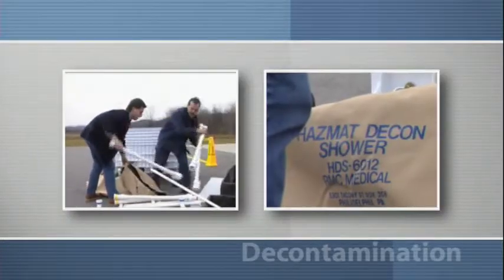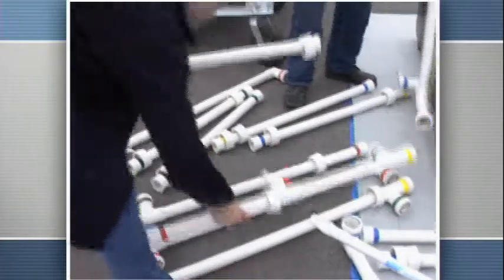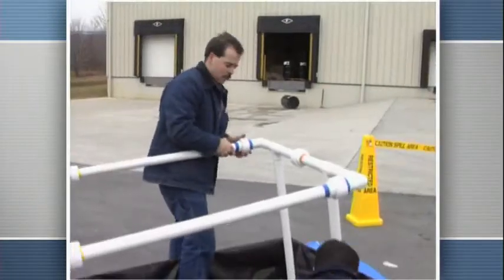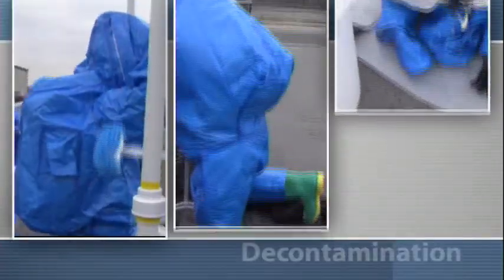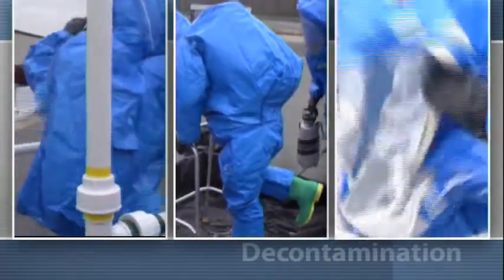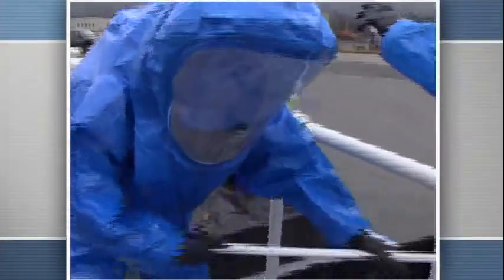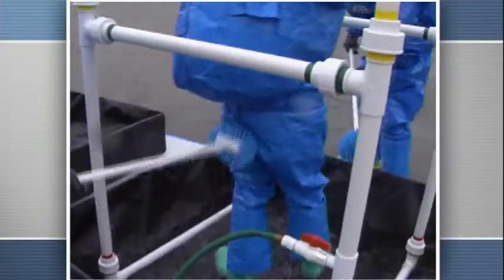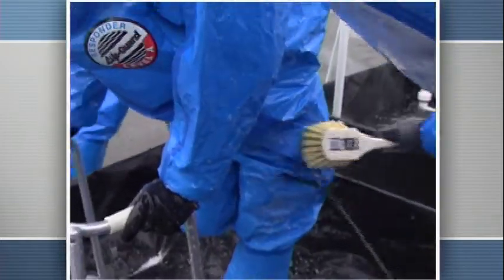The first step to decontamination is prevention. No one should ever enter a dangerous hazmat spill zone until a decontamination area is ready. You may have to remove and dispose of clothing, or thoroughly scrub and rinse yourself with soap and water, or a chemical neutralizing solution. Decontamination techniques should be practiced so that you are best prepared when a hazmat spill occurs.